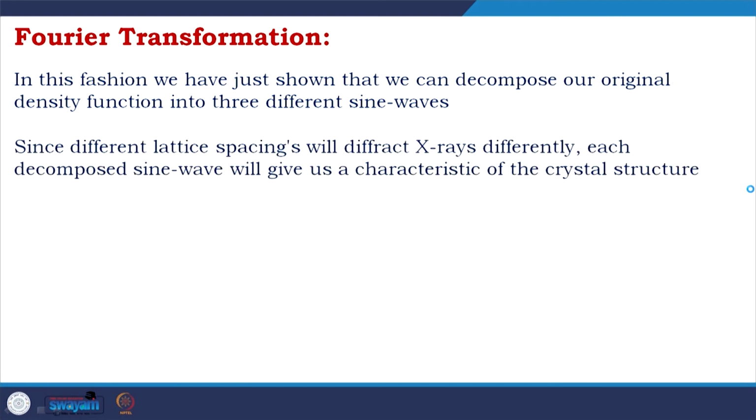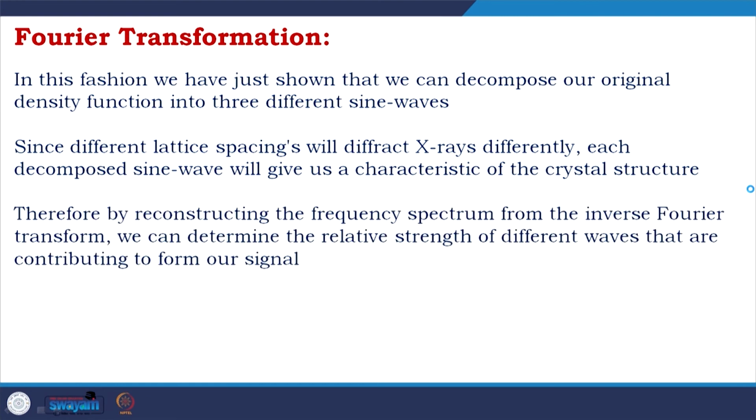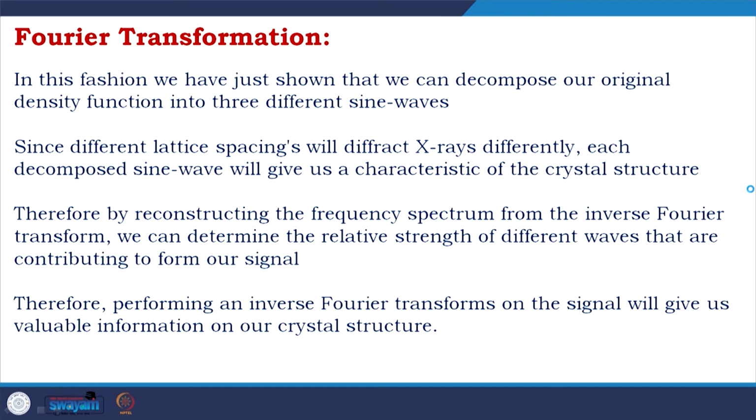Since different lattice spacing will diffract X-rays differently, each decomposed sine wave will give us a characteristic of the crystal structure. Therefore, by reconstructing the frequency spectrum from the inverse Fourier transform, we can determine the relative strength of different waves that are contributing to form our signals. Therefore, performing an inverse Fourier transform on the signal will give us valuable information on our crystal structure.